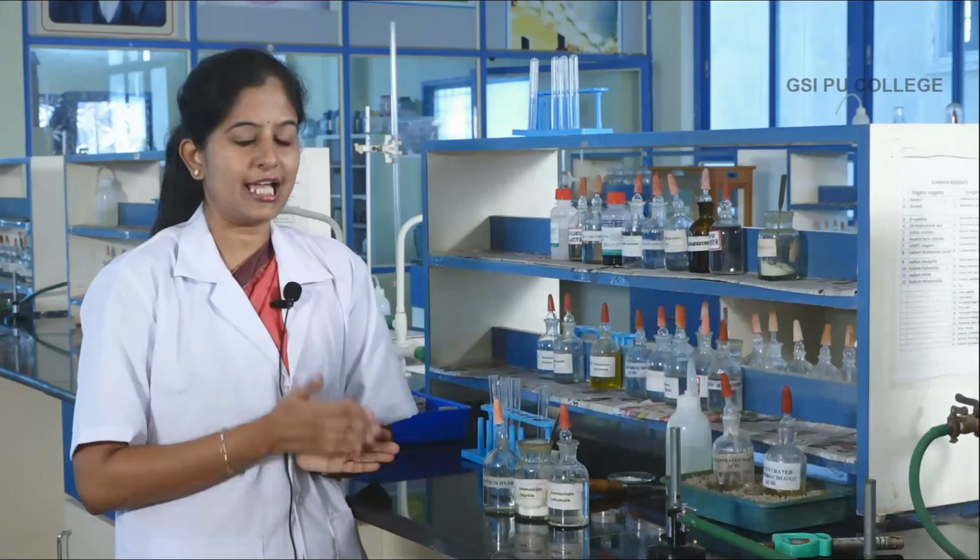That is because for this systematic procedure you will be having 1 mark. That is, one after the other there is an orderly arrangement of these radicals. So, because of the orderly arrangement, you must show the absence test and only then go ahead. Hence, analyze barium, strontium, calcium in order. So, first let us move on to the analysis of barium.